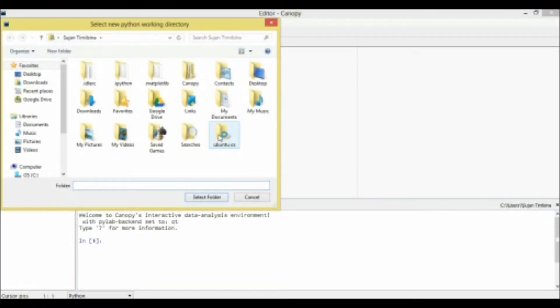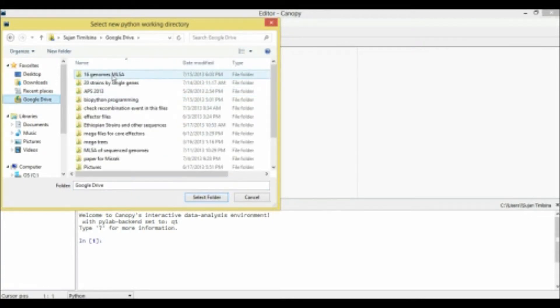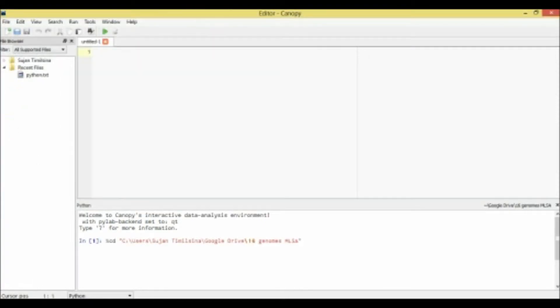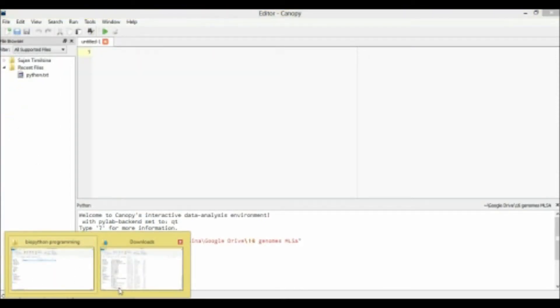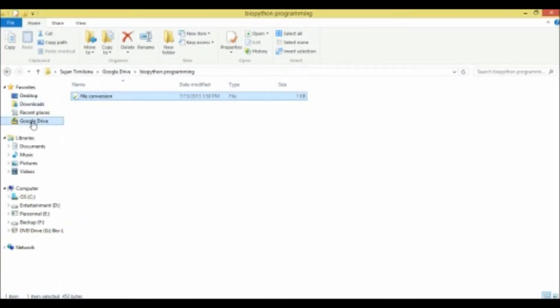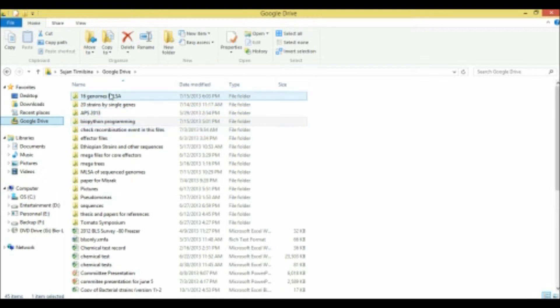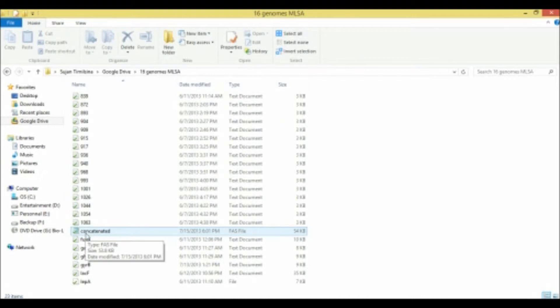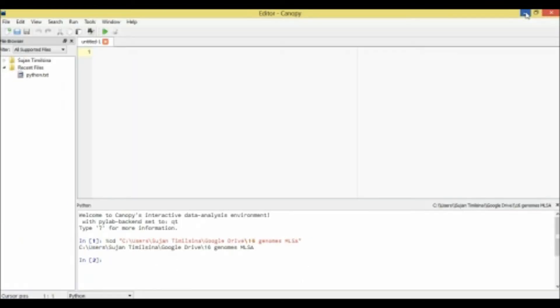So first we need to choose where our file folder is, where our sequence is, and my sequence is in that folder. So I'll select that one and let's see if I selected the right folder. Yeah, there is my sequence, concatenated, which is a FASTA format file, which I'll be using for this purpose.